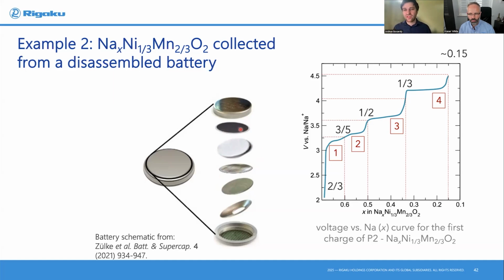It's made out of the as-prepared battery material mixed with some carbon and polymer, PVDF, with solvent to make a slurry that you then can cast into a film. The carbon's there for conductivity, the polymer's there as a binder. So it's not just the material, it's sort of this hybrid film. Okay, and so we'd like to be able to study it.